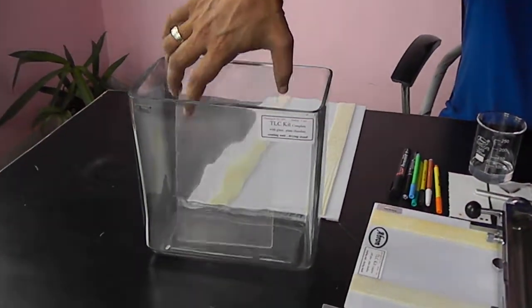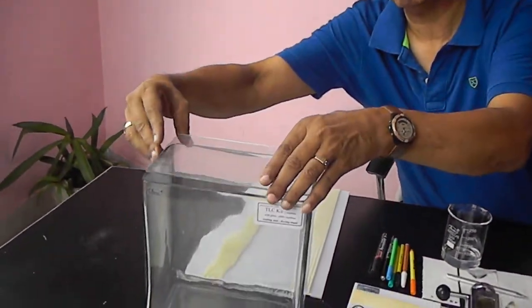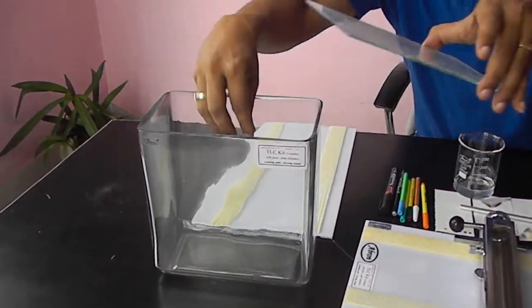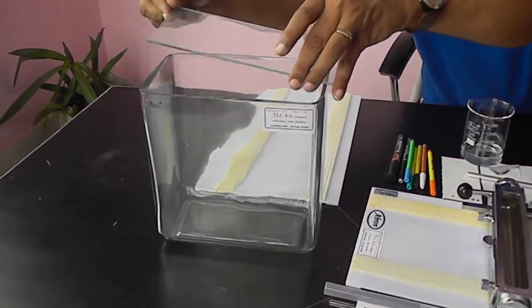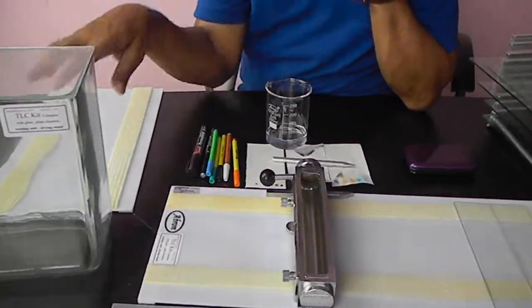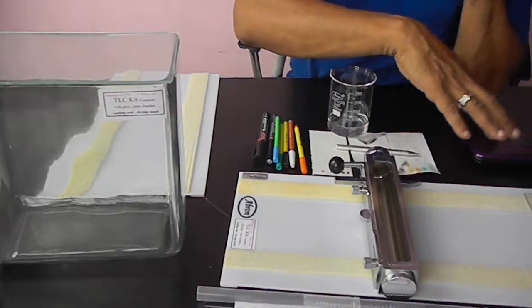You put the one plate, I have kept it just for sample. This is for closing the top. You put the solution, acetone or water or whatever is there. Or paper strips can be put like this inside, or you can put the glass plate.